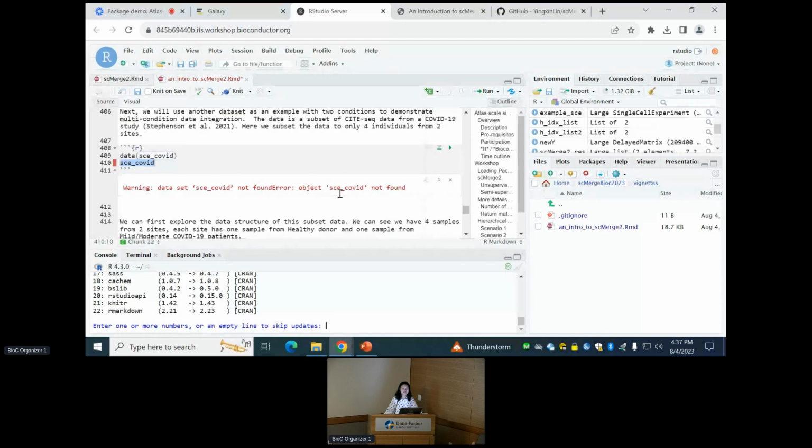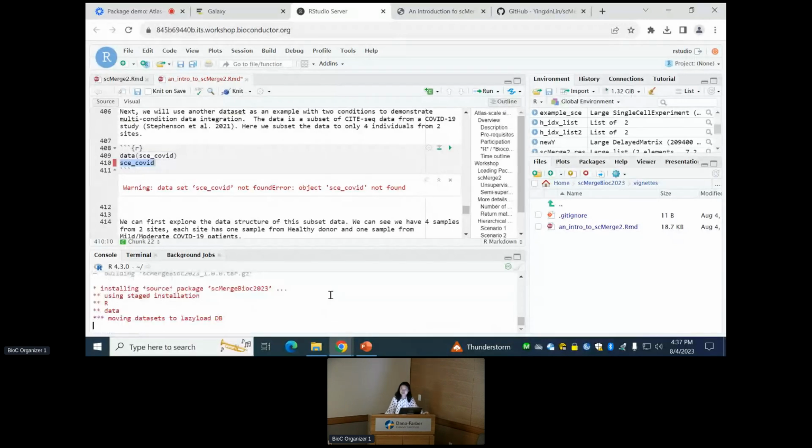That's a very good question. I would imagine in this case, the negative control genes would be the ones that try to estimate the unwanted variation.